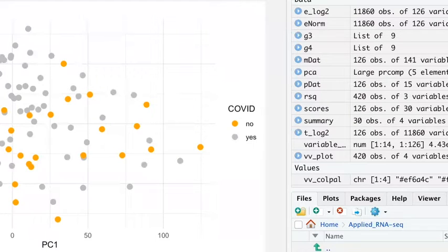So, looking at the question, whatever result you're getting, it depends upon the questions you're asking, whether it's a good result for you or not such a good result or what you were expecting. But again, there are no right or wrong answers. It's just what it is and the questions that you ask of the data.